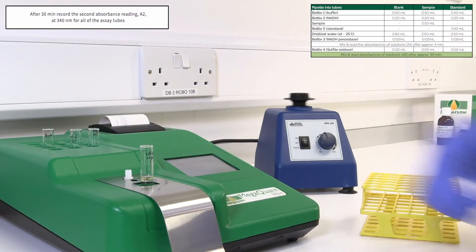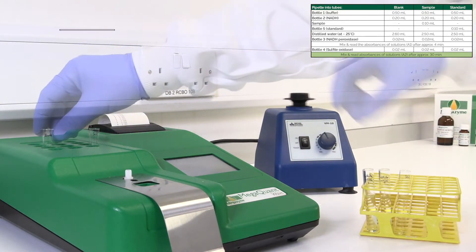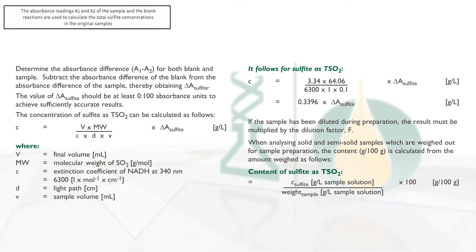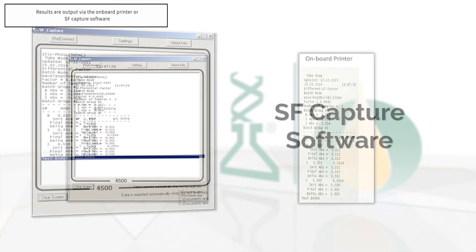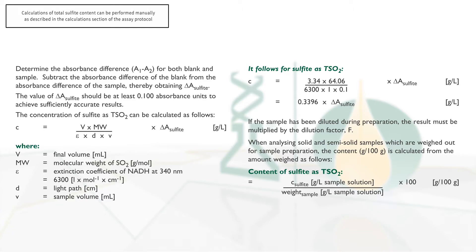Mix the tube contents thoroughly and incubate the tubes at 25 degrees Celsius for approximately 30 minutes. After 30 minutes, record the second absorbance reading A2 at 340 nanometres for all of the assay tubes. This absorbance reading completes the enzymatic total sulphite assay procedure. The relevant absorbance readings A1 and A2 of the sample and blank reactions are used to calculate the total sulphite concentration in the original samples. If the results output are raw absorbance values, the calculations of total sulphite content can be performed manually as described in the calculation section of the assay protocol.